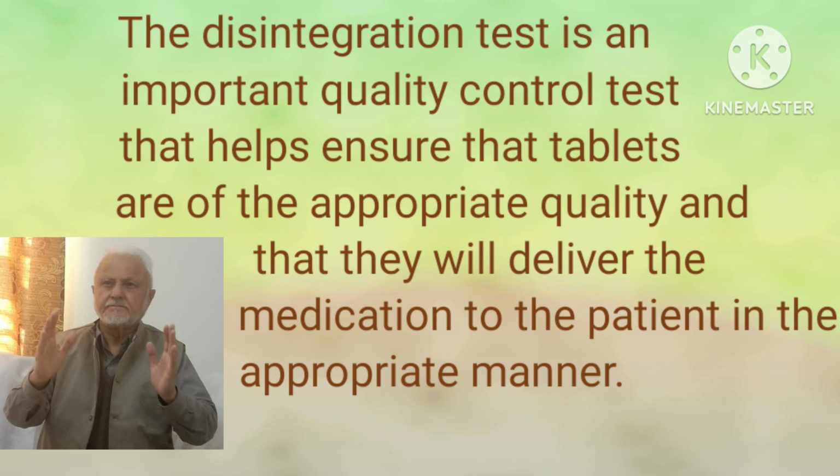The disintegration test is an important quality control test that helps ensure that tablets are of the appropriate quality and that they will deliver the medication to the patient in the appropriate manner.